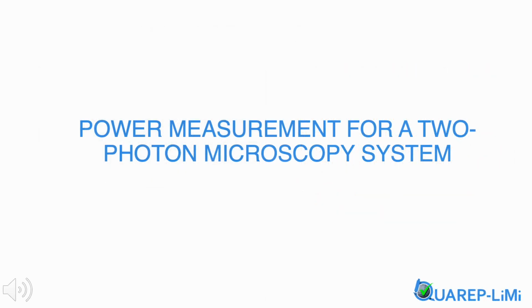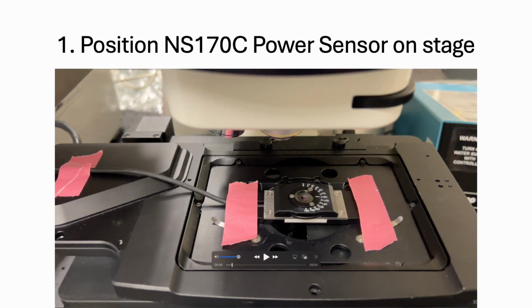Now, let's walk through a step-by-step demonstration of how to perform a power measurement for a two-photon microscope system. The first step is to securely position the NS170C two-photon sensor on the microscope sample stage, aligning it directly beneath the objective. Ensure the optimal longitudinal position is less than 30 micrometers in depth with high numerical aperture (NA) illumination. In this demonstration, we use a 10x air objective. To minimize the risk of component damage, begin with the sensor positioned below the focus, and gradually raise it until it comes into focus.